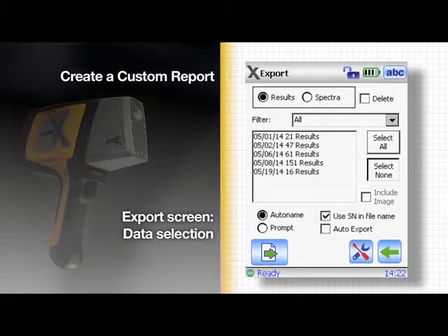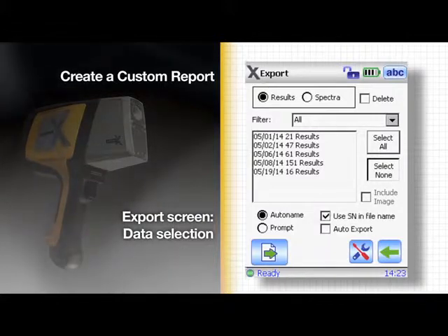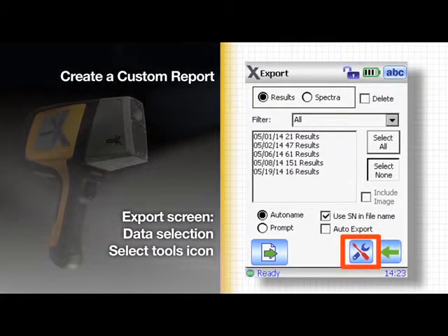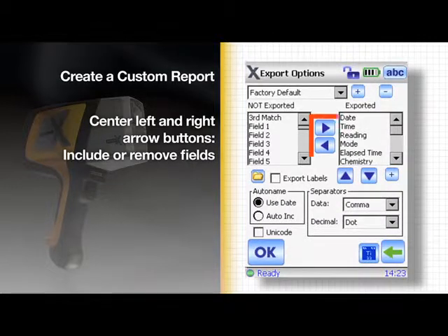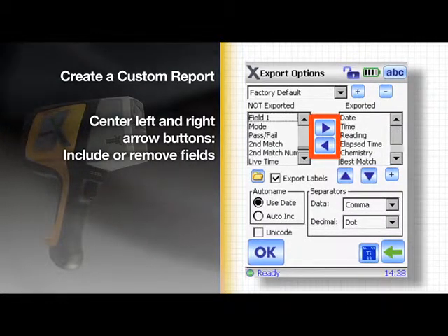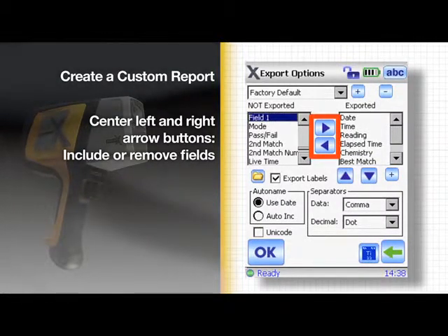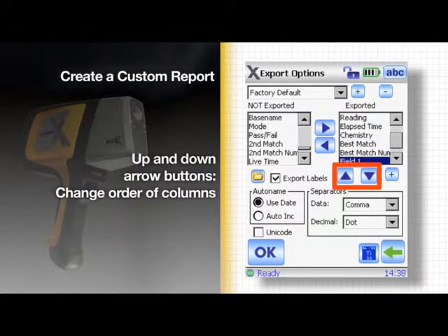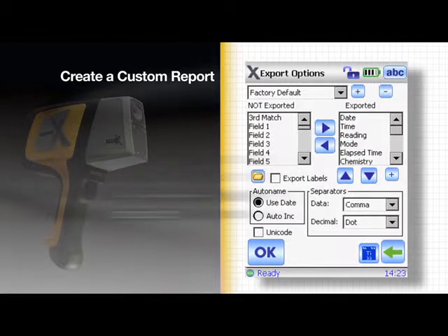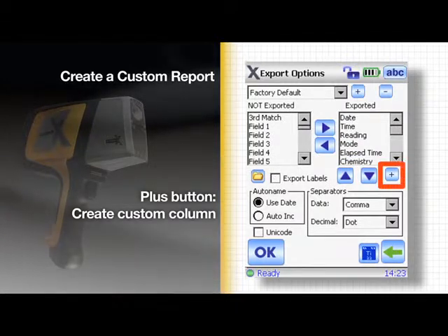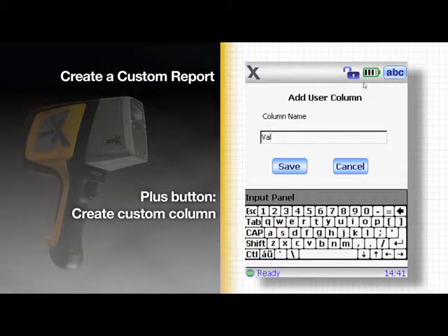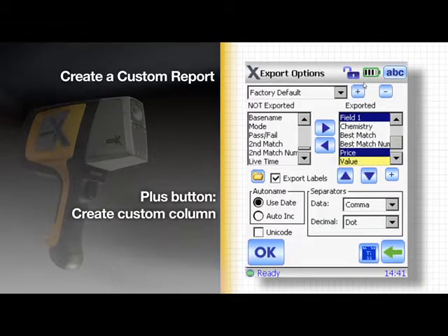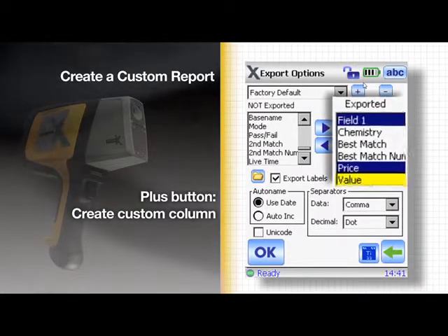Here is where you can select what data you want to export. Select the tools icon again. Use the center left and right arrow buttons to include or remove fields from the report. Use the up and down arrow buttons to change the order of columns displayed. You can tap the plus button to make a custom column of your own — it will be added to your list of exported columns.